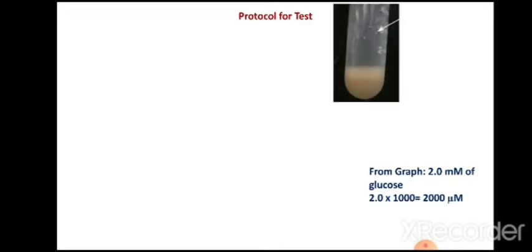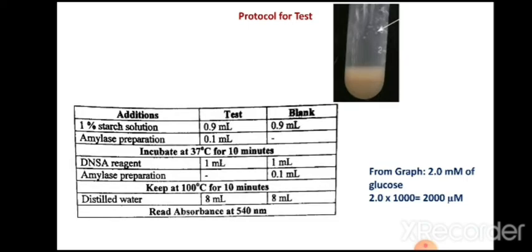So this is the supernatant as a result of production. This is centrifuged. The cells are settled down and now the supernatant is ready for the measurement. We want to determine what is the concentration of amylase in this given supernatant. So this is called the crude extract.